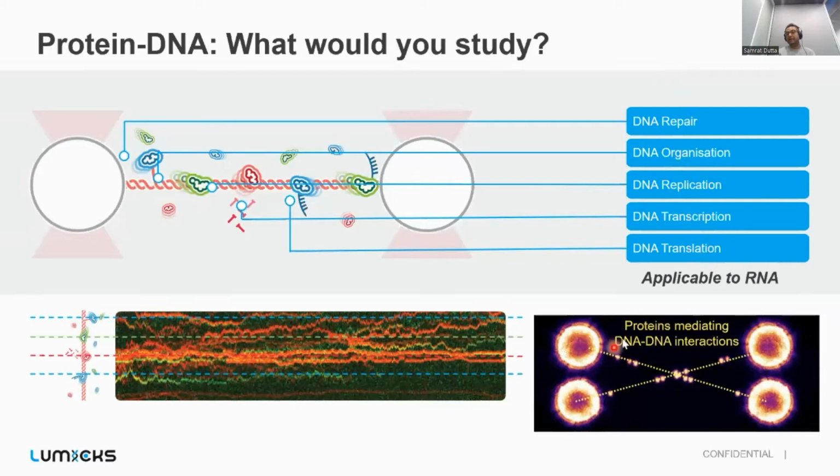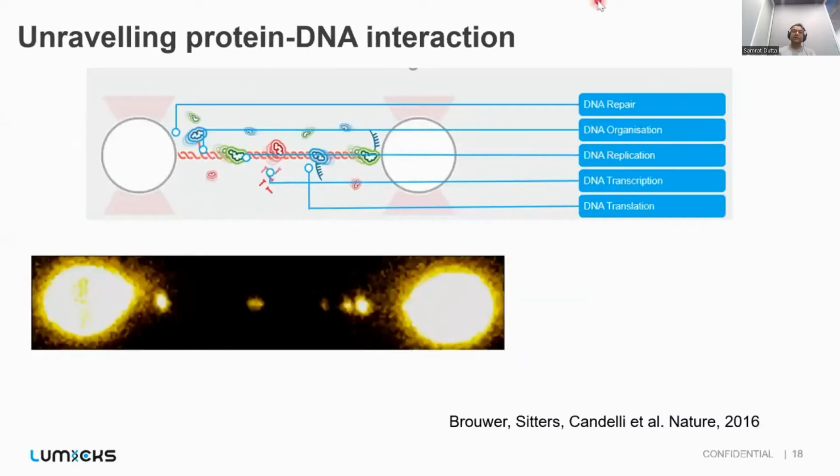And as I can say, it can also be used to study the Holliday junction, where four different traps are used to study how a protein interacts across the Holliday junction. So I will quickly go over how a protein-DNA interaction experiment is done with real data to show you how it is done in the C-trap. So essentially what's done is, at first, in this case, two streptavidin coated beads are trapped in the dual trap.